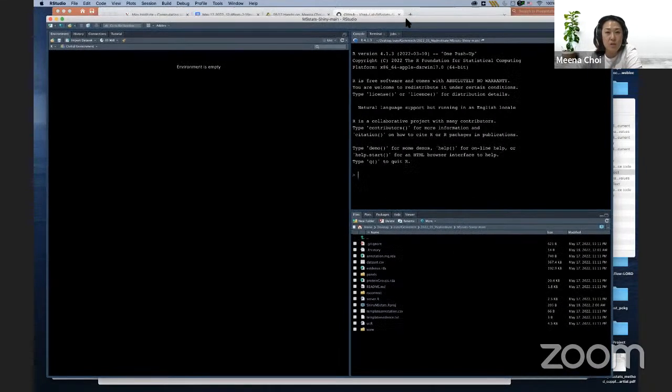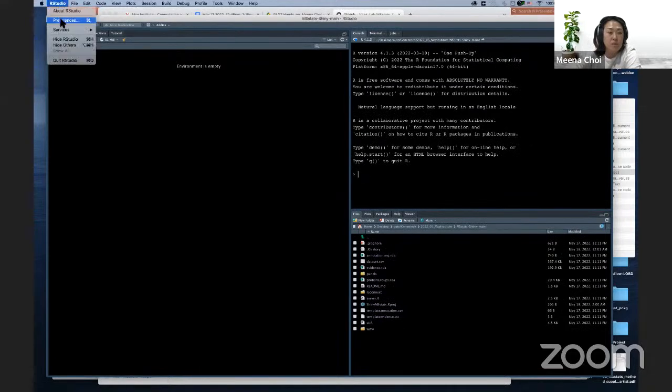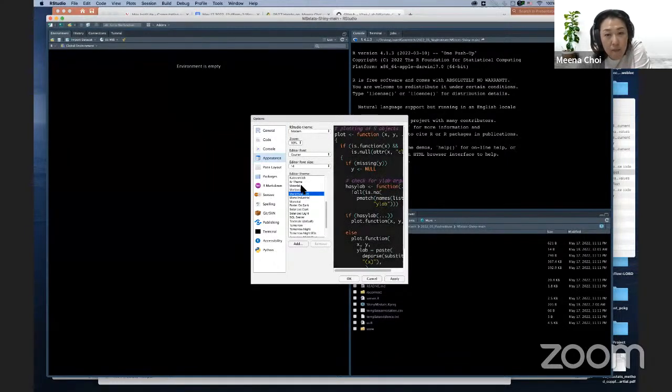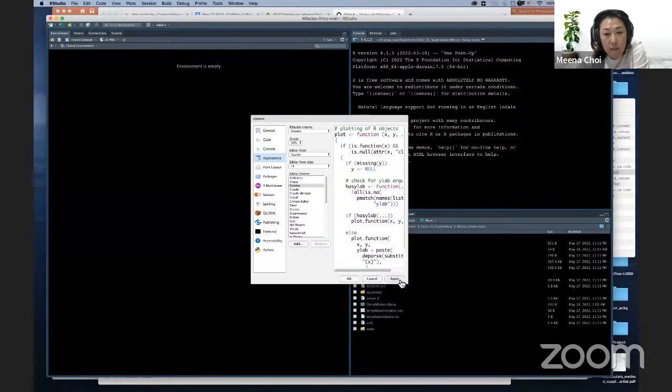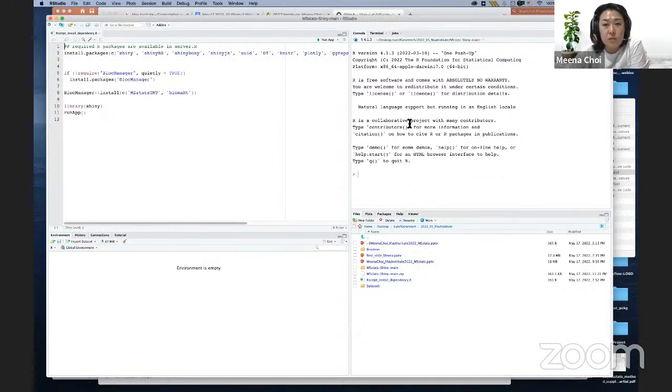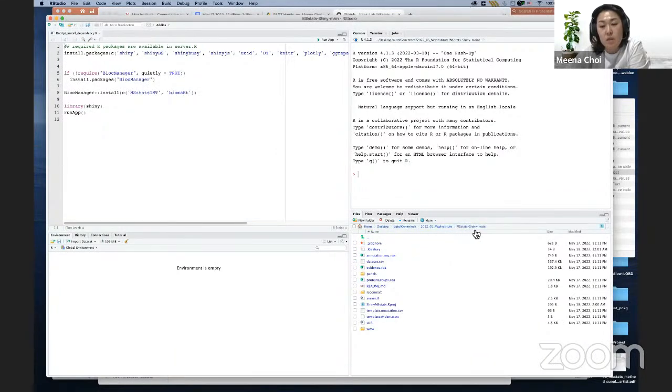If you already learned R, this is the console, which is what we are going to use. Is everyone okay so far? The right panel is the console, here is our script, here is the environment panel, and this one shows the files, plots, packages, etc. We have to go to the MS-Shiny main folder, and just double check.